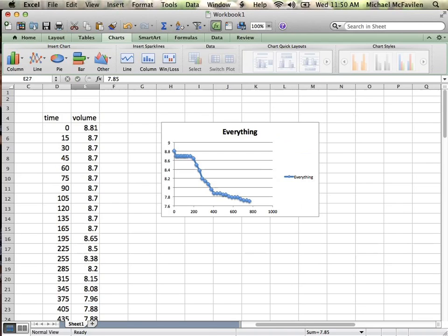Okay. Another thing that's going to be important to mention here, you've got your volume measurements as 8.81, 8 something, etc. Is that what everybody has? No. What do you guys have? For your volumes, what's your start volume? 8.85 milliliters. Anybody else? 0.88. It's 0.8.